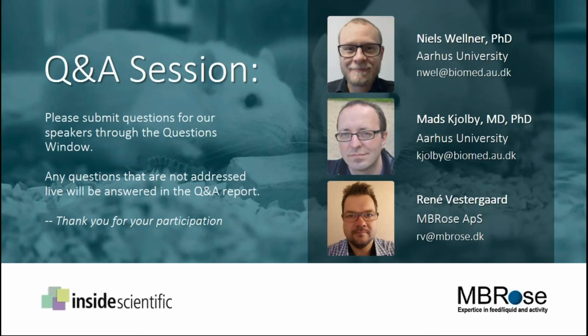You can, however, set limits for what is a meal, what is the maximum weight of a meal for each mouse. You cannot stop it eating, but when you look at the data, you can extract these things. But as Mads says, if you want to restrict the access, you close this metal plate to the channels manually. But this can be done quickly. Okay.